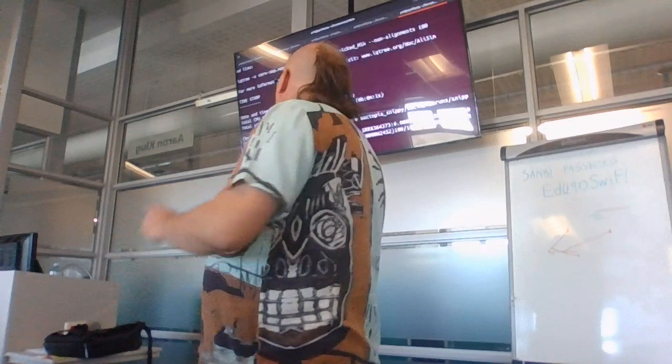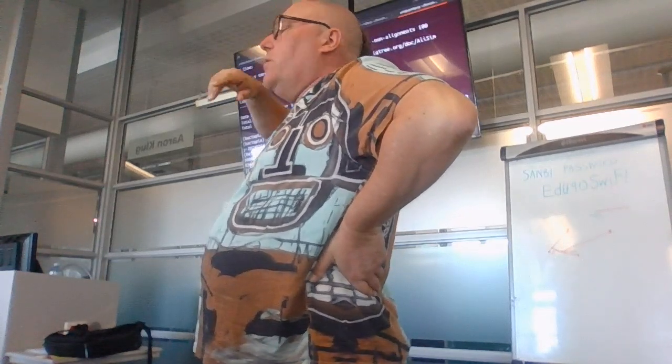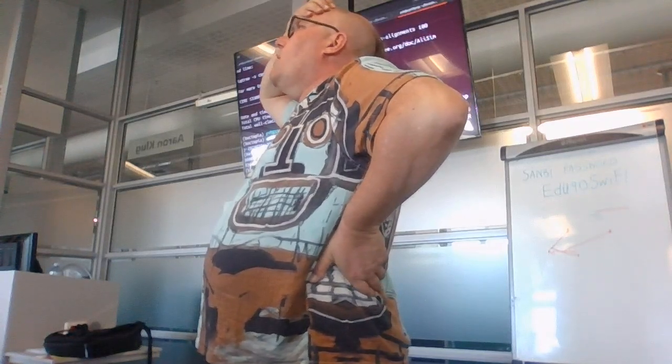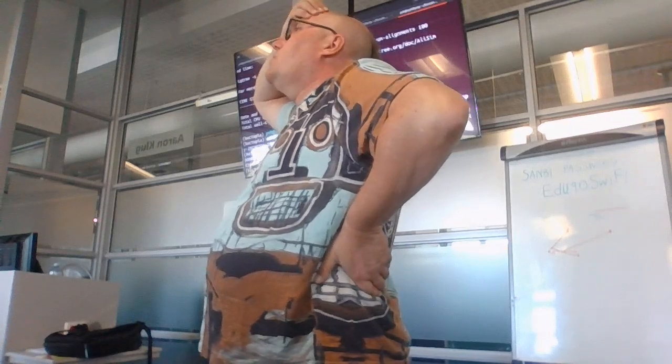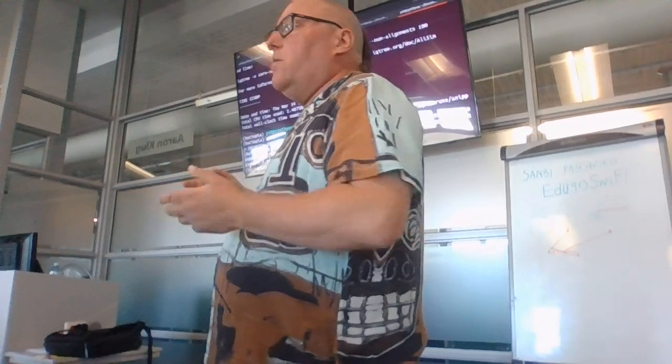So Bactopia assemble, by the way, does something very similar to Snippy. Yes, it's pretty much the same procedure. But then you looked at the MultiQC, which has your BAM quality report output. In fact, I was going to talk to Robert and say, can we include the MultiQC that they're running in Bactopia, because it's looking at BAM QC. I think it also uses fastp for filtering. I can't remember what it uses, but it uses one of the quality trimmers. It uses FastQC as well.